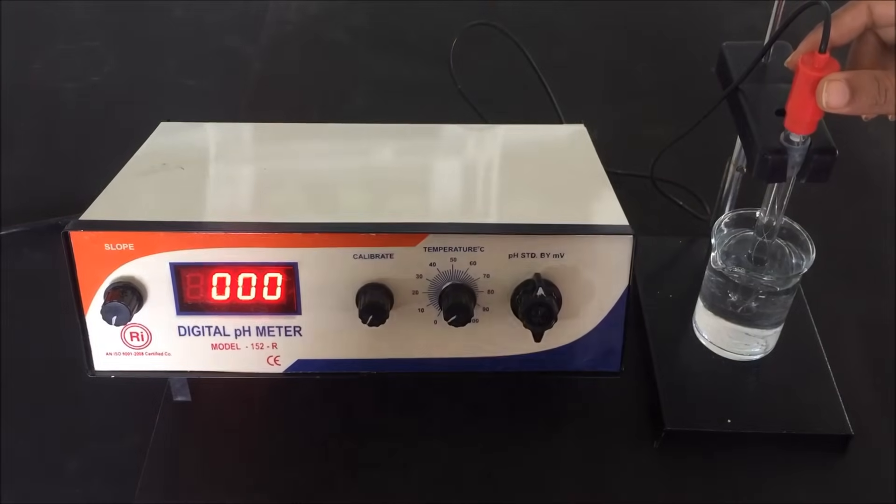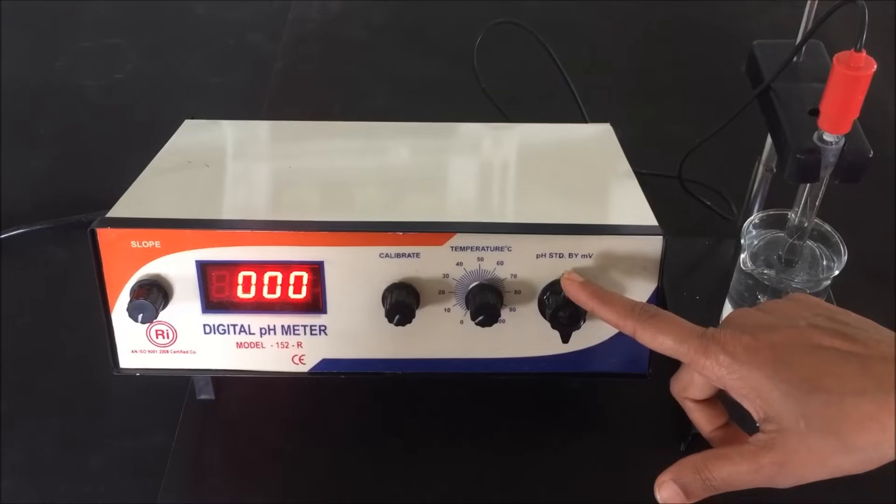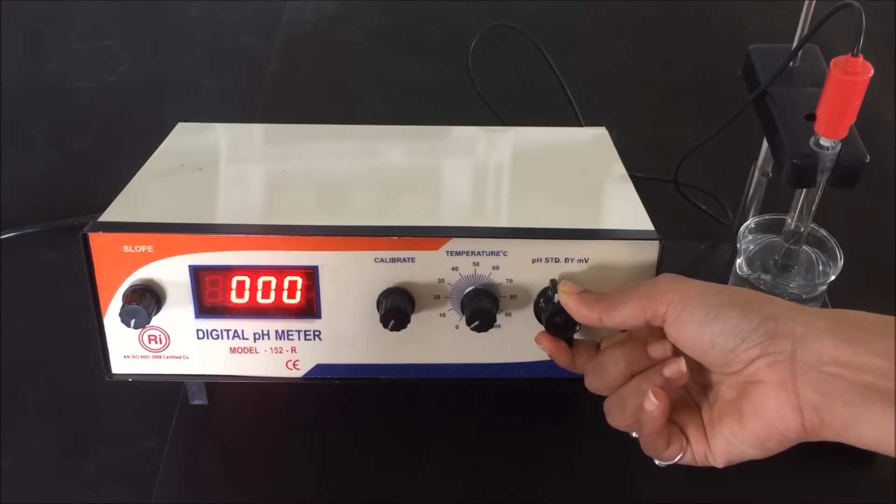In the first part, we will demonstrate the parts of a pH meter. This is the pH electrode, which is dipped into distilled water. This is the pH meter. This is the function knob, which has three modes: pH mode, standby mode, and MV mode.